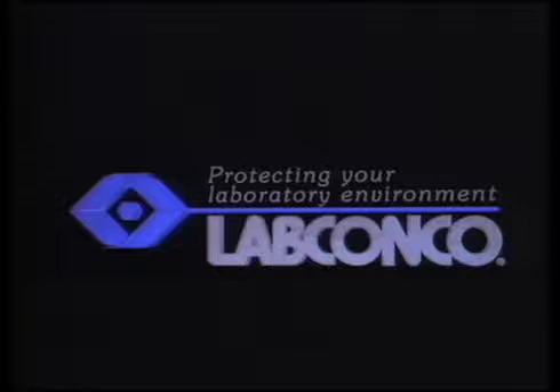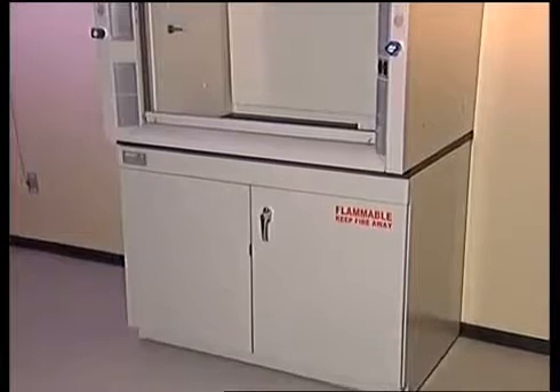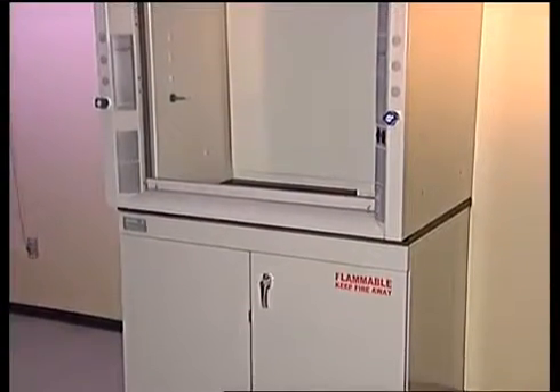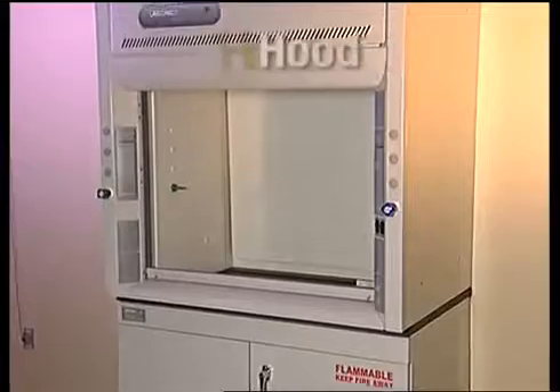LabConco, manufacturing quality laboratory equipment since 1925. Your LabConco products have been shipped to you assembled and ready for connection to services and ductwork. This video covers installation of the Protector Solvent Storage Cabinet with molded epoxy work surface and the Protector Premier Laboratory hood.